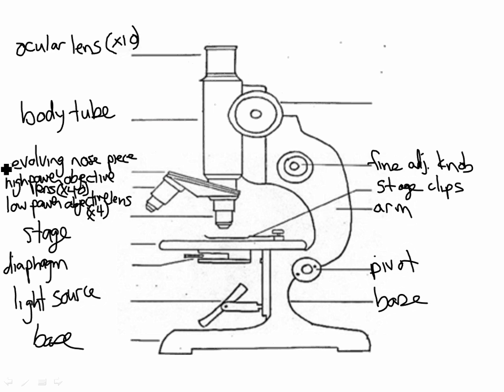And this one up here is the course, and I always spell it wrong. Did I get the right course? Is that the right course? Oh, that's like a meal or something? I don't know. Oh, and now I've screwed it up. Oh my God. Is that better? Course? Adjustment knob. See, all these words, they cause me stress.